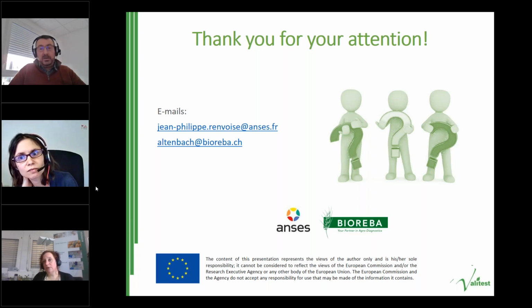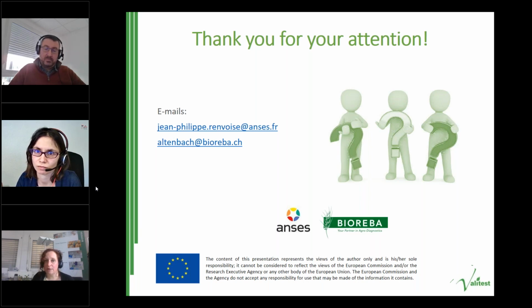Yeah, if you need to do validation, I think you should have a positive sample and one negative sample. And usually if you have the host plants, you can do some collections. And if you get clear negative results on leaves without symptoms, I think you should rely on it, because you don't have to do a full validation if you rely on what work was done by the manufacturer or if it was published somewhere or whatever. But a negative control and a positive control, I would recommend always.